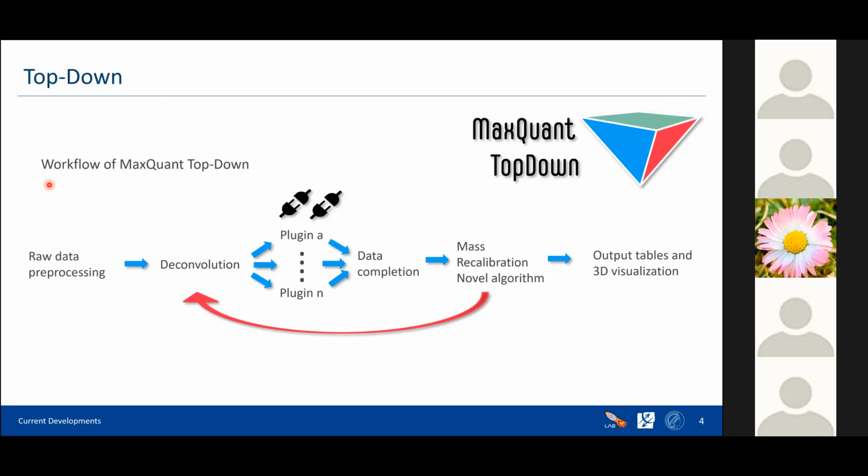For example, we have many more charge states. We have a whole variety of masses. I mean, we have all the variety of the proteins being there. So if we don't cut them into unified length pieces, we can have all kinds of masses. That makes things quite difficult.